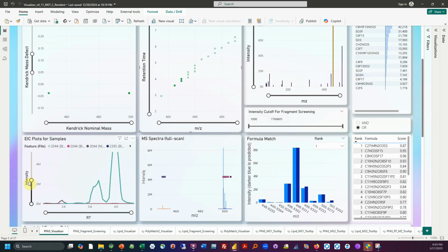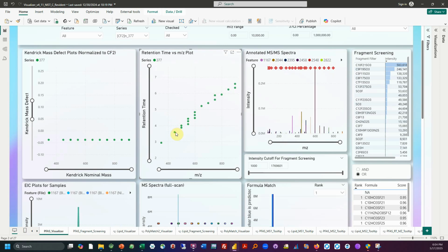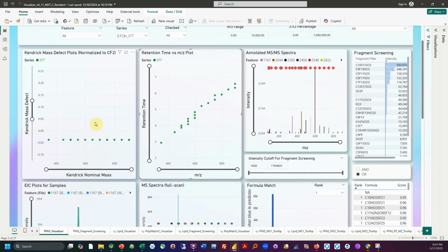You can even see that there may have been a third peak over here if we zoom on the y-axis that was missed, so 3 isomers. Even under these peaks, sometimes they're wider, there could be multiple peaks, we just don't know, showing that there's many potential branched PFAS or other types of isomers. So, with just these 3 pieces of information, I can be confident because I got a score of A, being highly confident, less than 5% false positive rate.